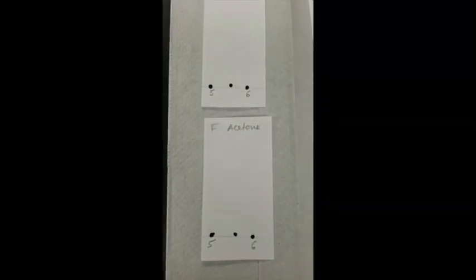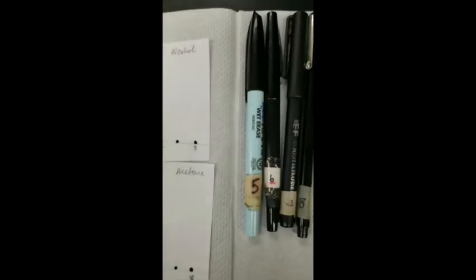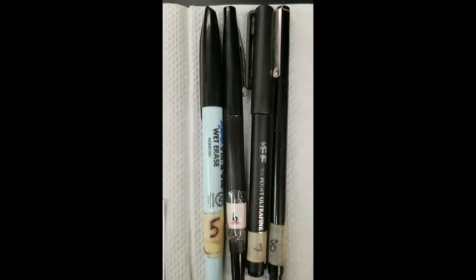In this frame, you see the papers for known F just right before placing them into the mobile phase. You also see the reference pens that were used to place the dots on these papers.